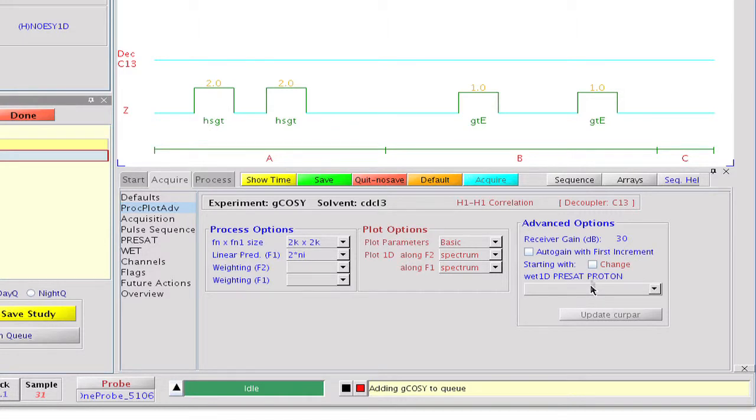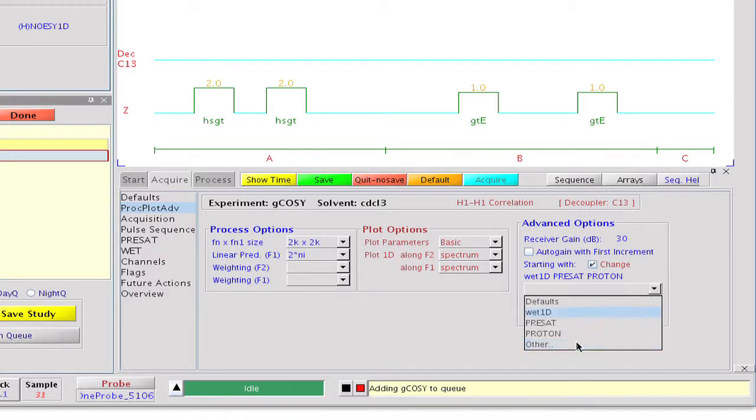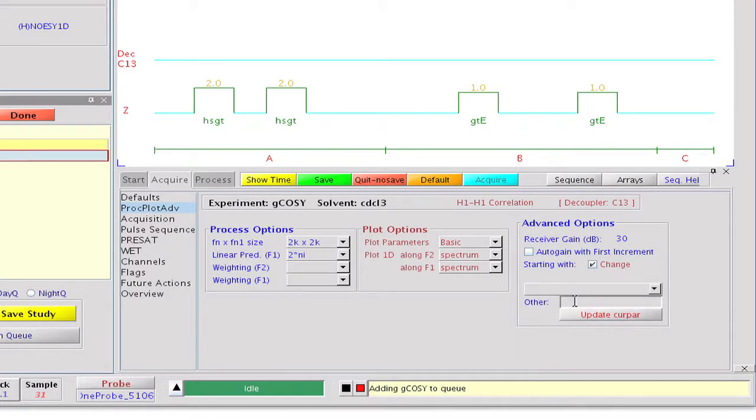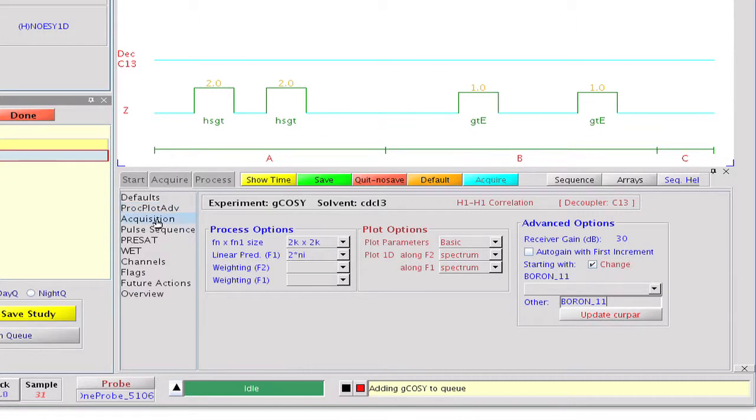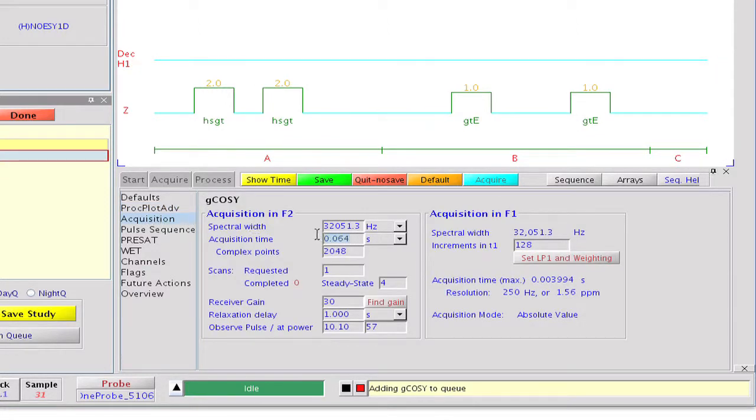A proton COSY is typically set up from a proton spectrum. Similarly, a boron COSY should make use of a boron 11 spectrum if it is available at the time the 2D experiment is requested. We continue by setting the acquisition time and the relaxation delay and reducing the number of steady state pulses to 4.